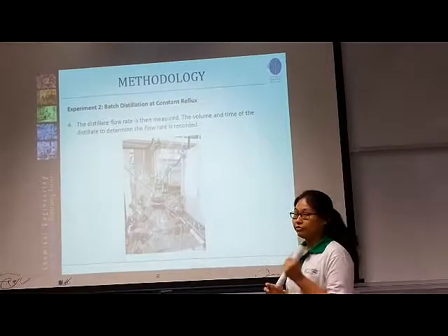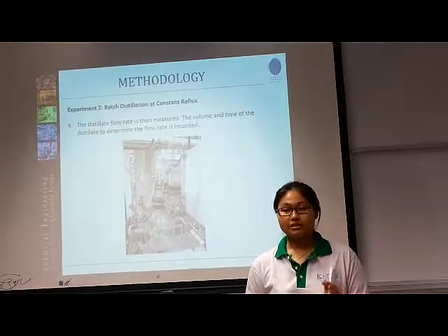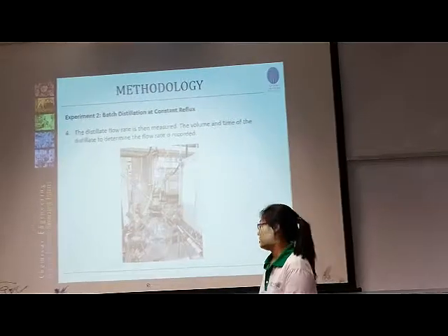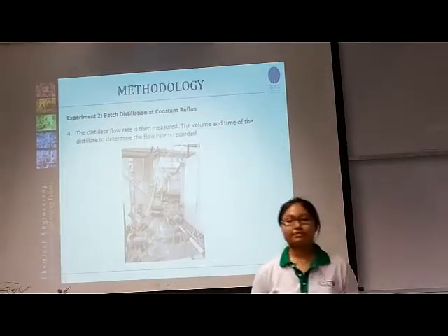Then the fourth step will be that the distillate flow rate will be measured. This is where you record the volume and time of the distillate to determine the flow rate.